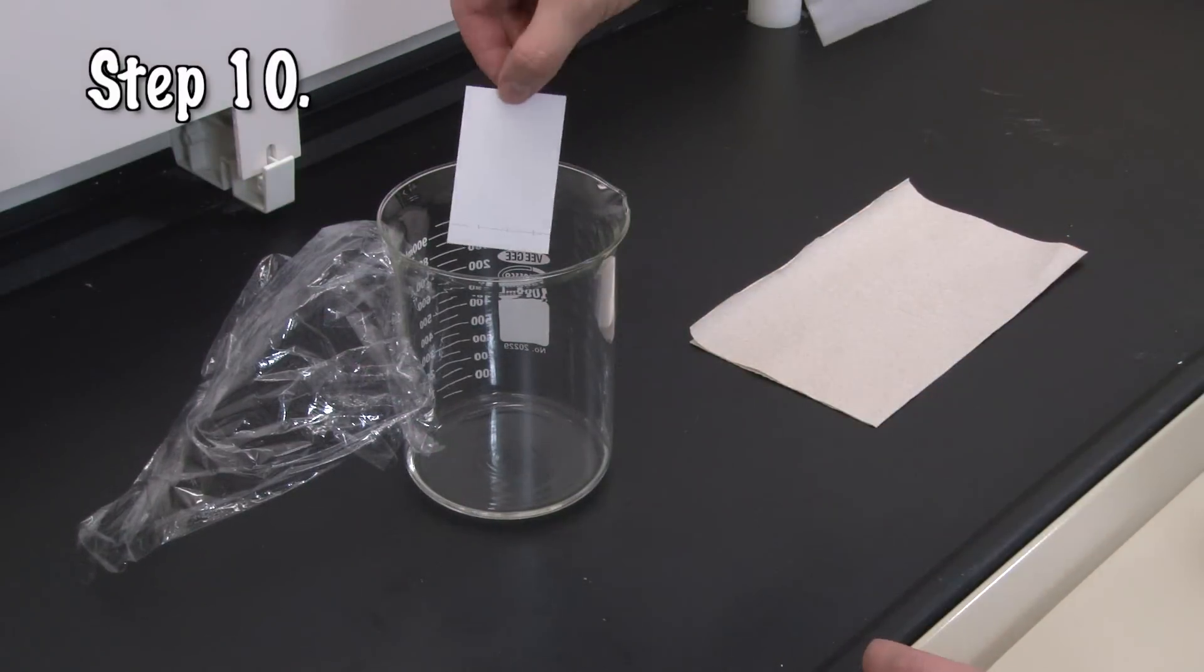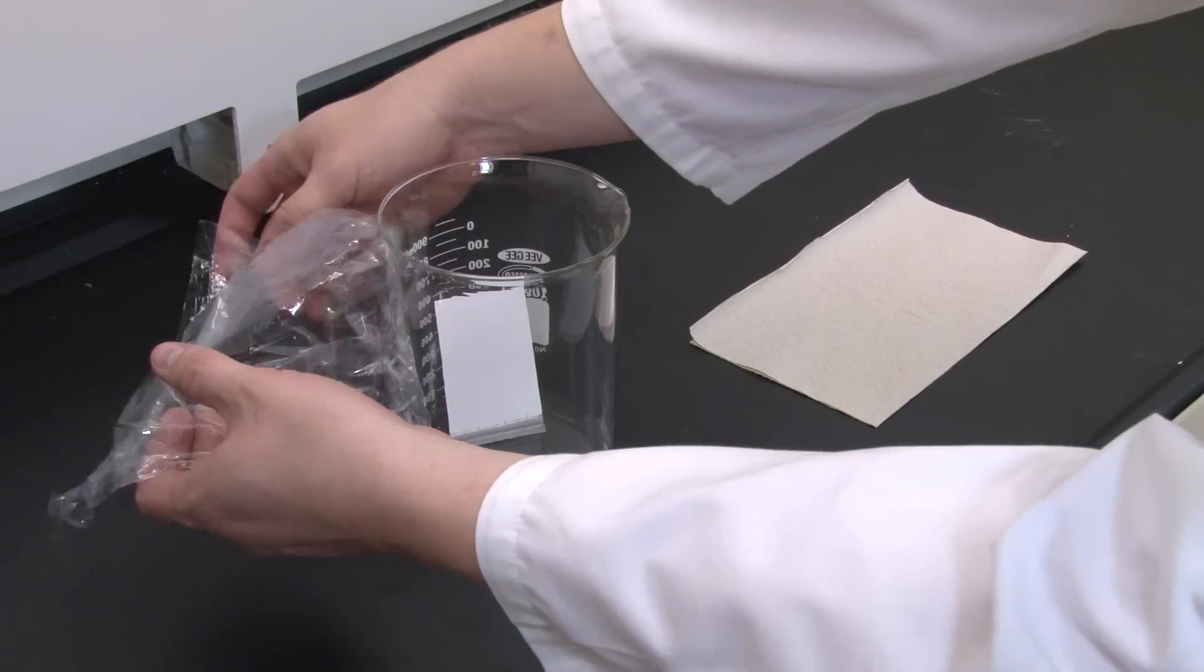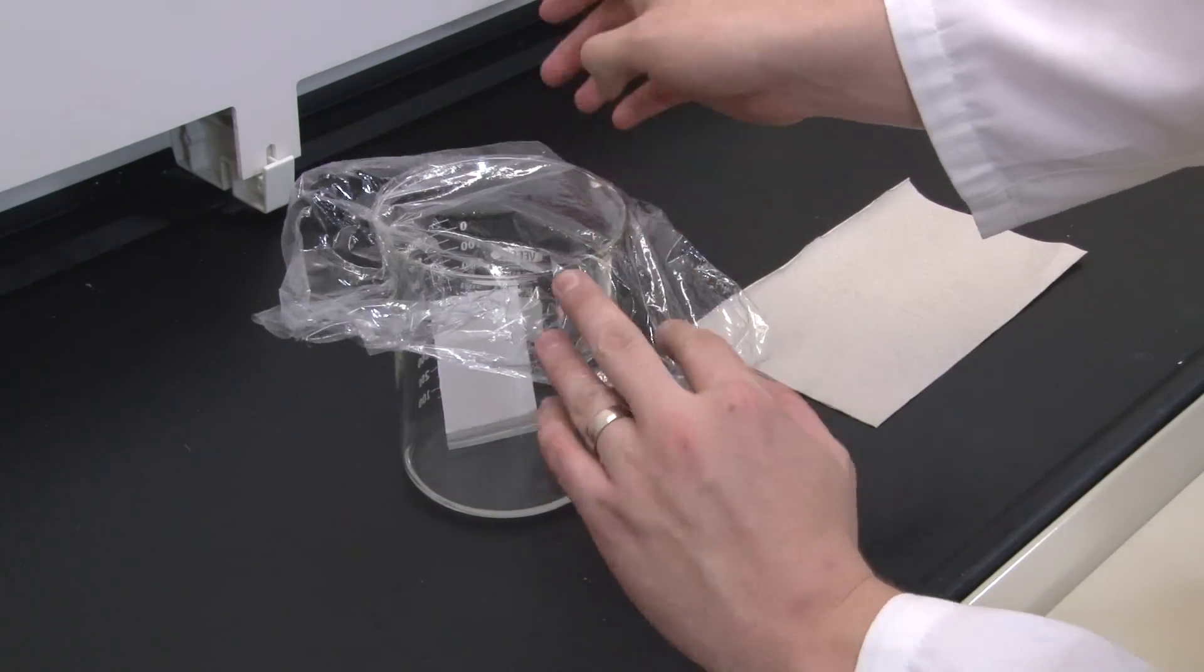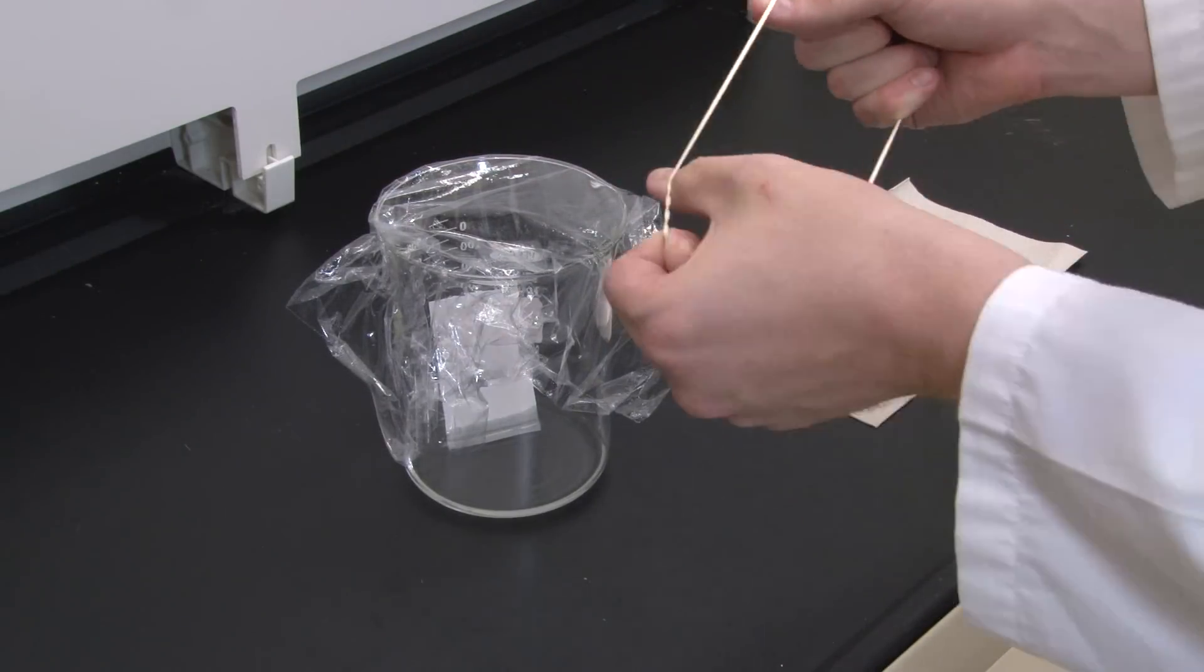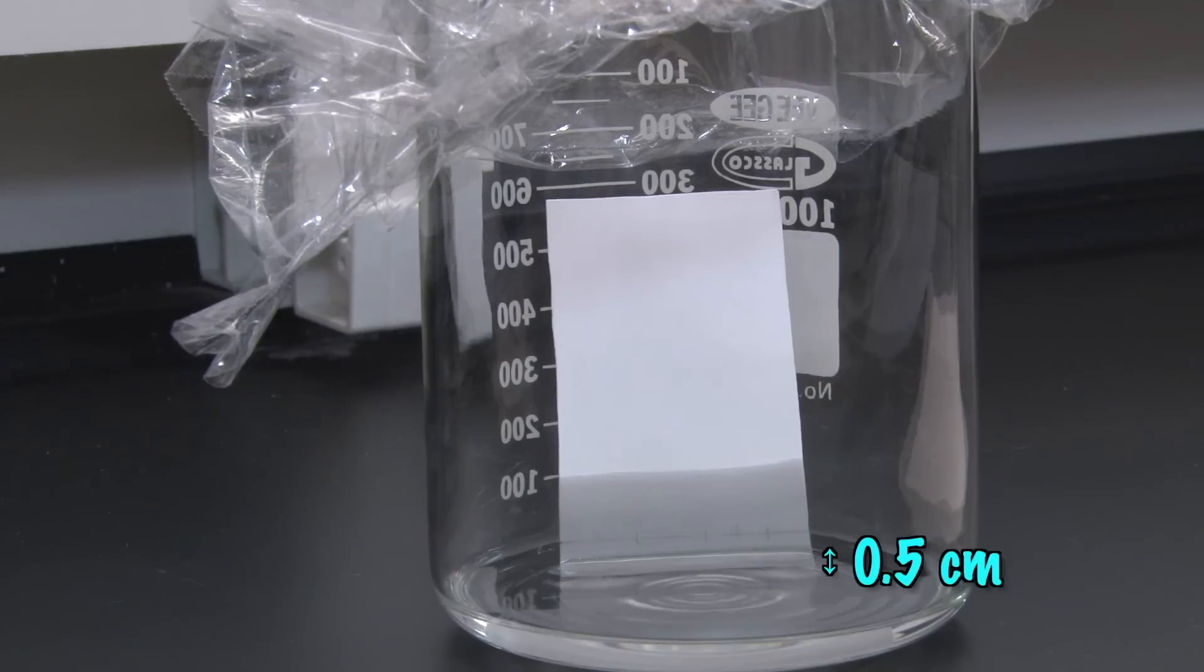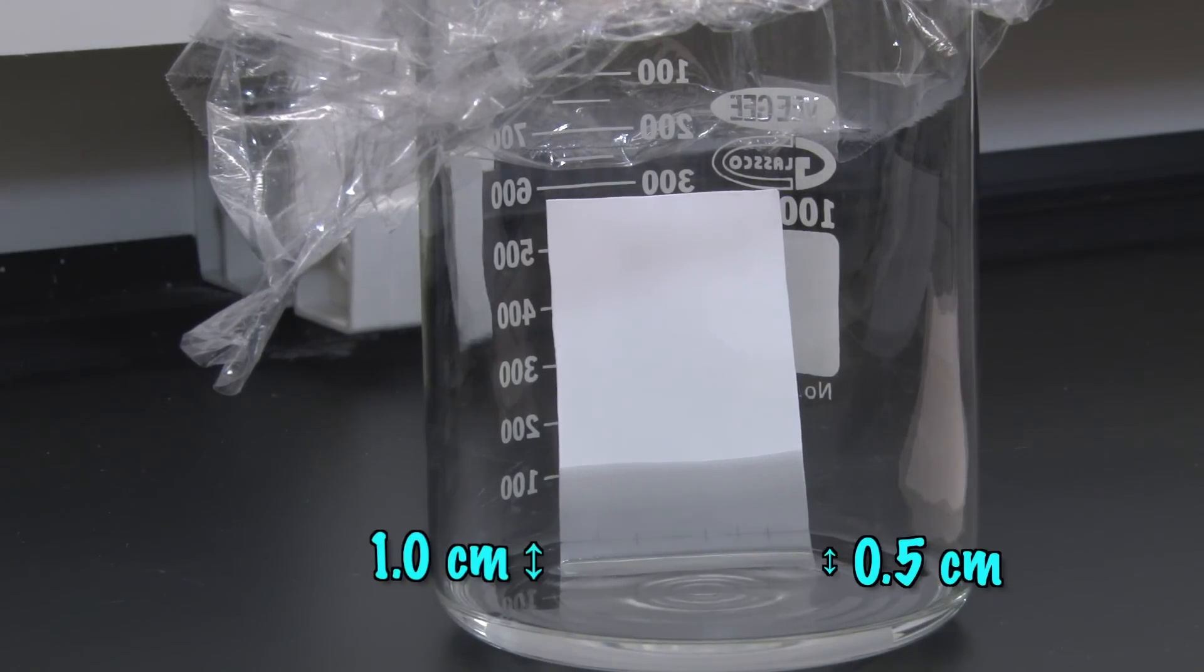Once all your spots look good, you're ready to carefully lower your TLC sheet into the developing chamber and replace the cover. Make sure the sides of the sheet don't touch the beaker, and make sure the spots remain above the surface of the liquid. That's why we poured the developing solvent to a depth of one half a centimeter, while the spots were made one centimeter from the bottom of the TLC sheet.